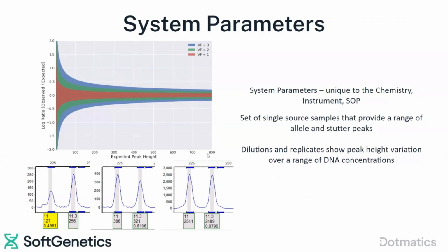So at higher peak heights, you expect to see nice balance between the peaks of a heterozygous individual at a locus. As you get down in peak height, you're not surprised that this is still a single person, just heterozygous. This is also from one single source file, but it's very low, and it has an RFU here of the tallest peak only at 250. And you're not surprised at that low RFU that there's a very significant imbalance, less than 50%, in the peak height balance.